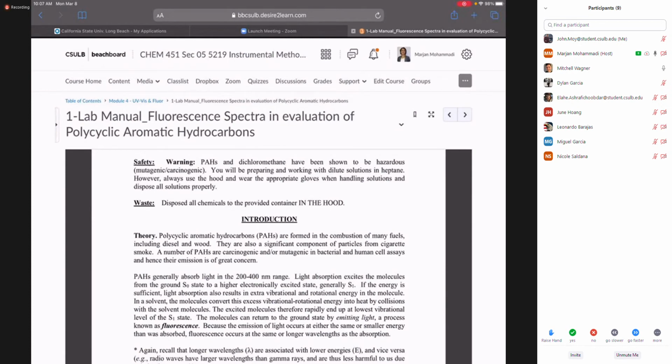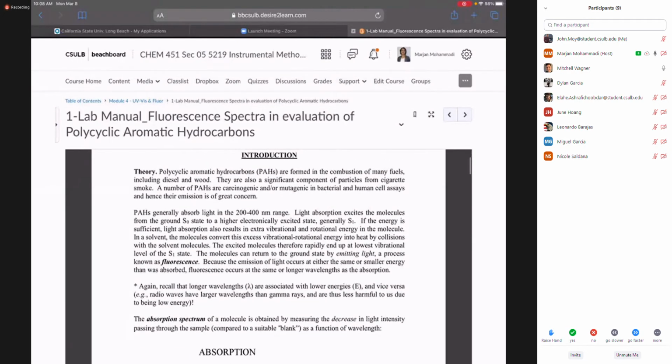For the fluorescence of anthracene, it might shift a little toward a higher lambda, which, you all know, means a little less energy, because some energy is spent in vibrational and rotational states. So don't be that surprised if you see it.